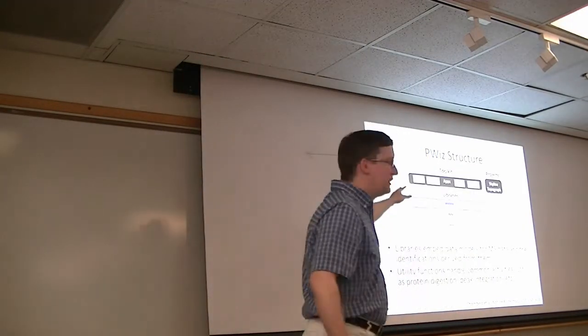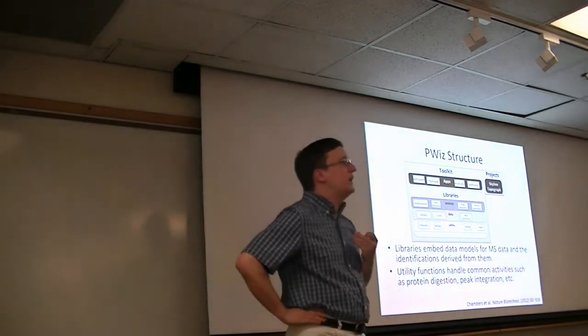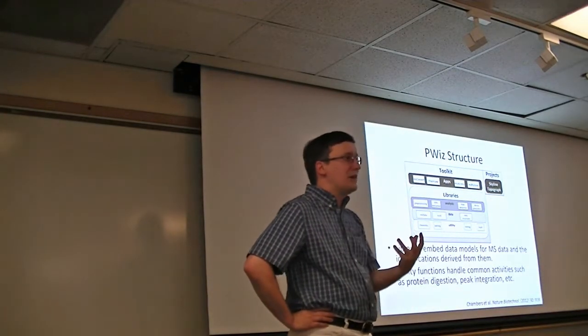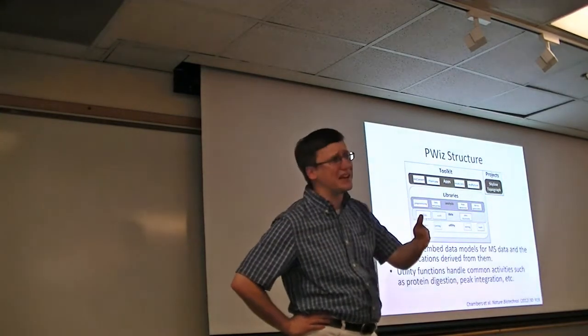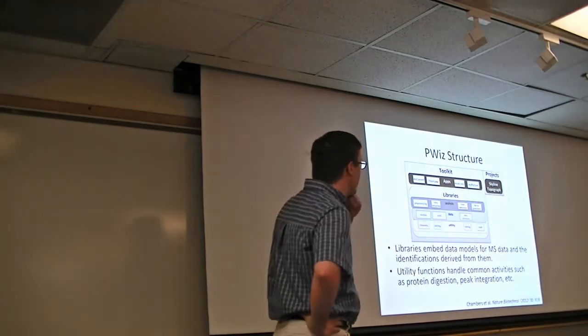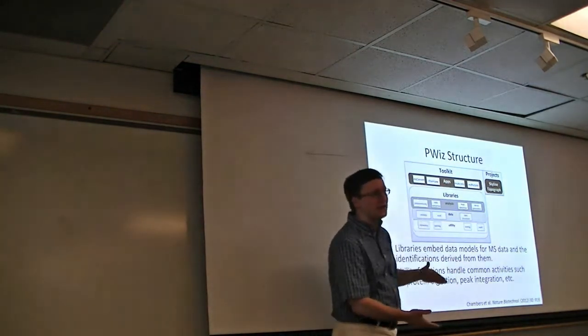Now, there are lots of different layers to these toolkits. So when we talk about ProteoWizard, we tend to talk about MSConvert a lot, and that's what the second lecture is all about. But within ProteoWizard, we have different stratifications of things.